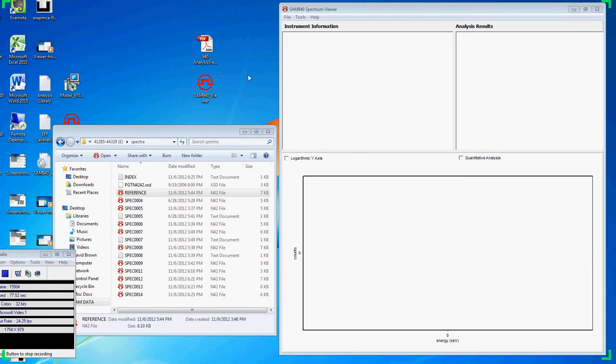In this example, we've moved the spectra folder from our compact flash card on the SAM 940 to the desktop of our PC.